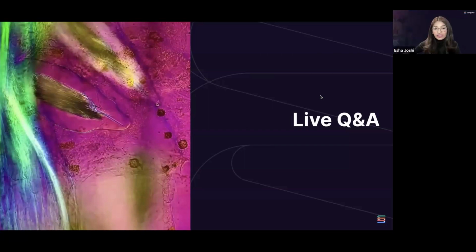Great question. Currently, sample sheets have to be provided through either data sets or some sort of path where the sample sheet might be currently stored. I think eventually the idea is that data studios might also enable you to create sample sheets through the interactive environments, depending on what kind of data you actually want them to encode.